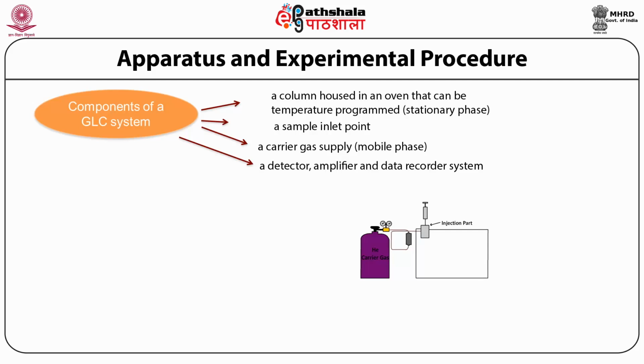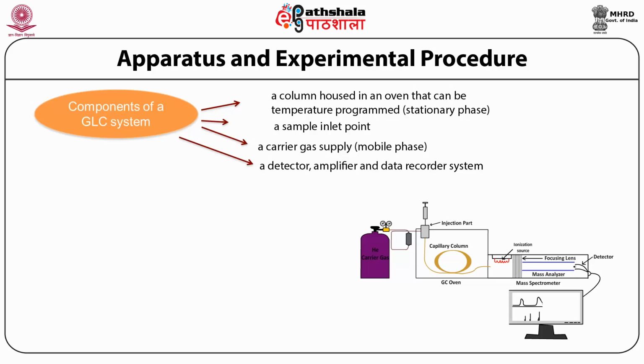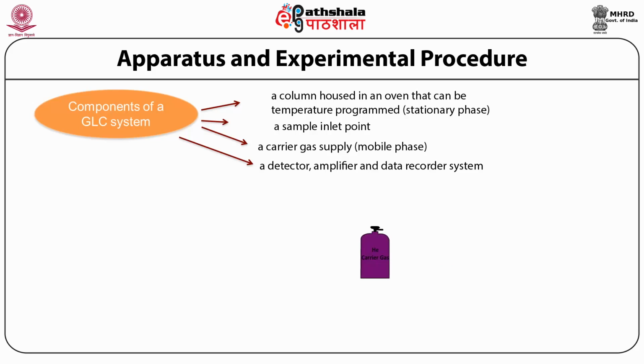The purple container here, which is marked as the carrier gas container, carries the inert gas like helium. So this inert gas is blown through the tube, and just at the top of the column, where you see the arrow showing the injection port, there is a preheater. So what is the role of this preheater?